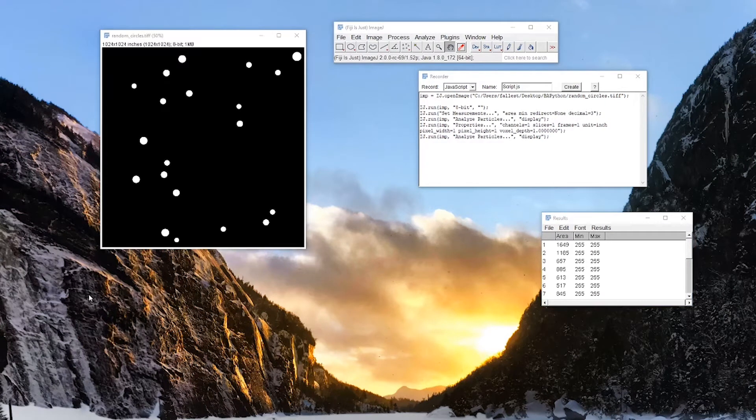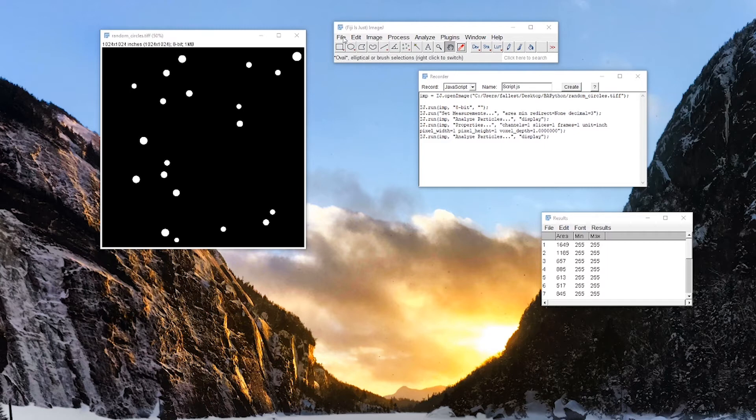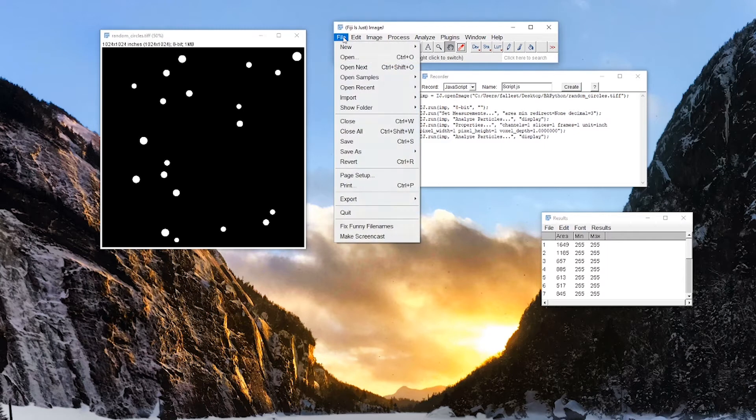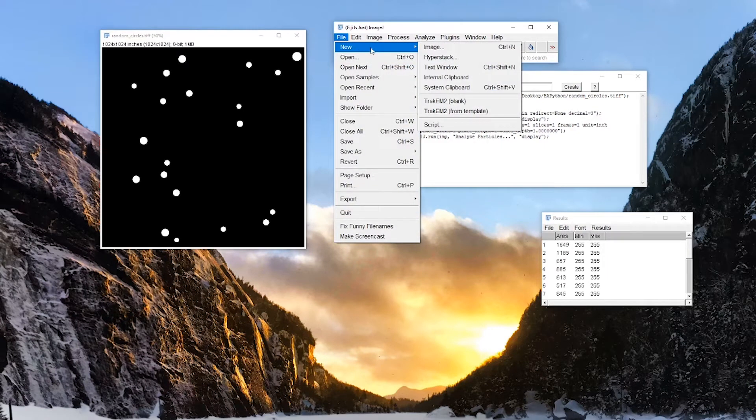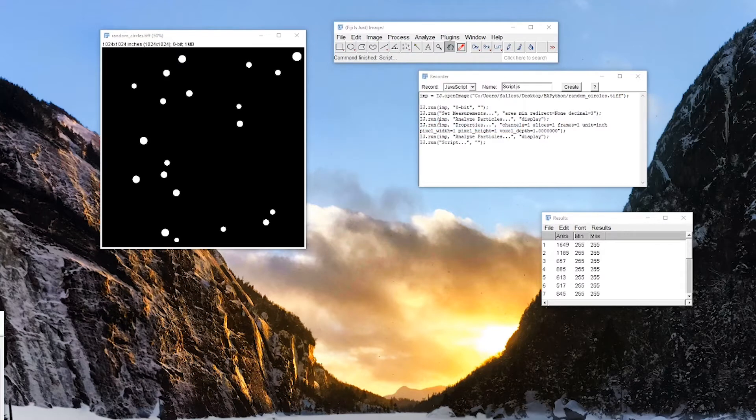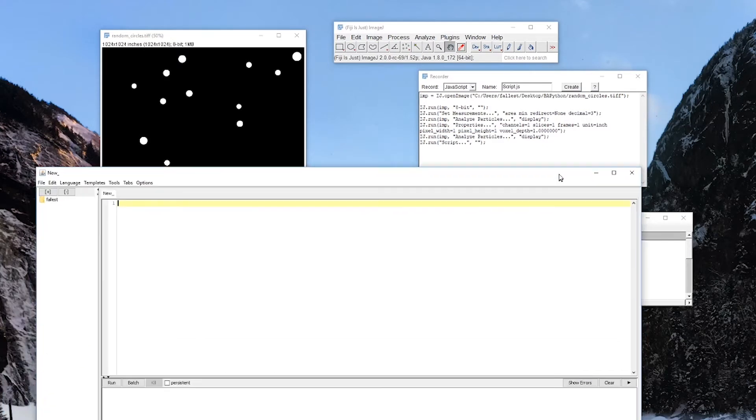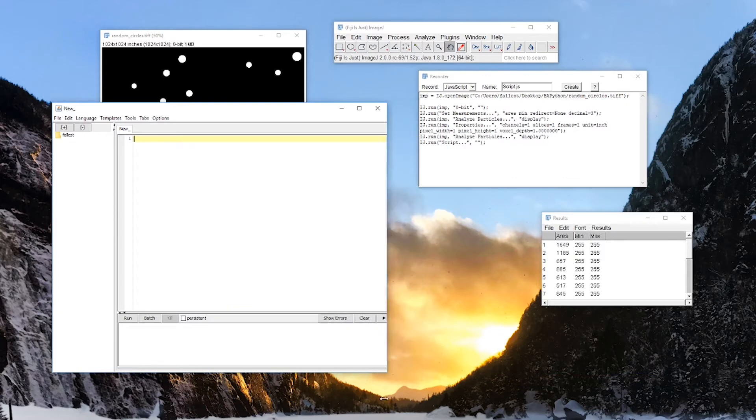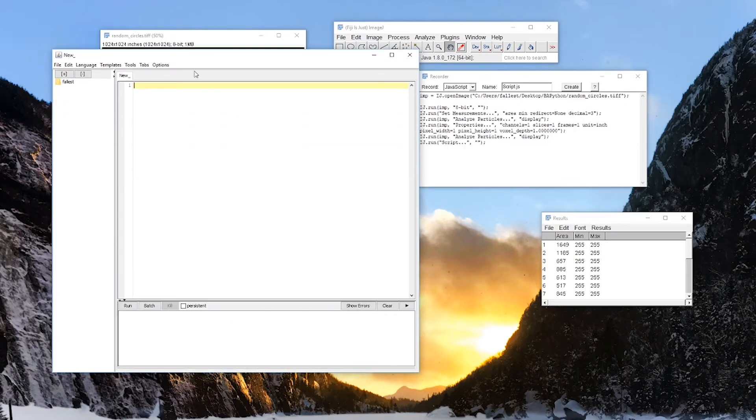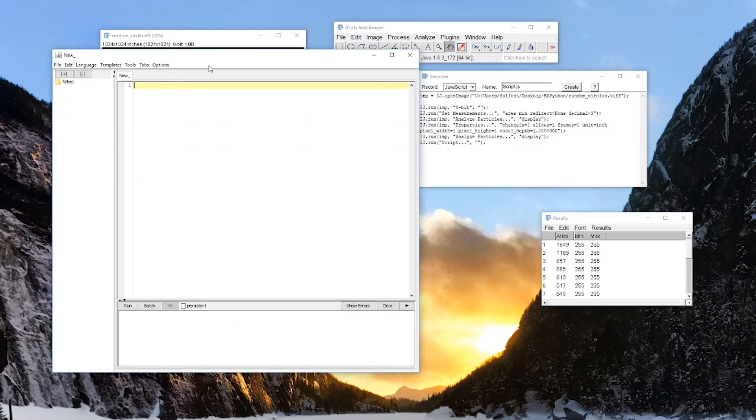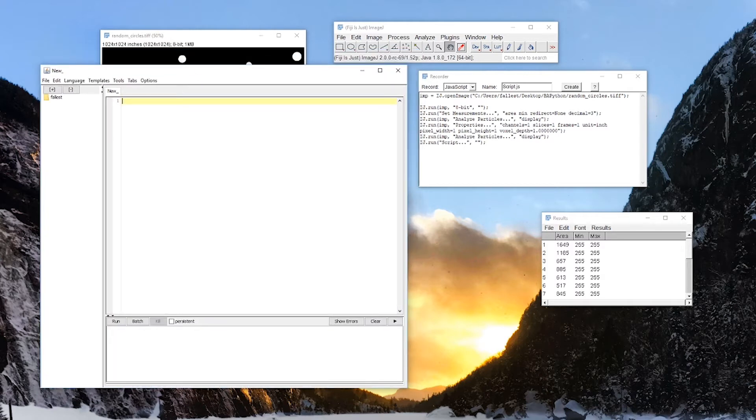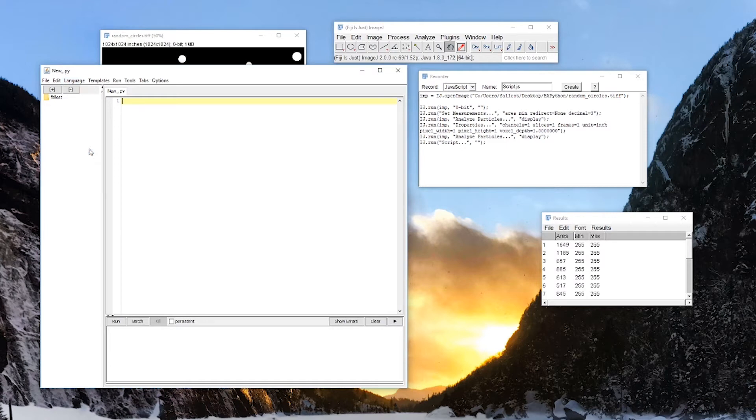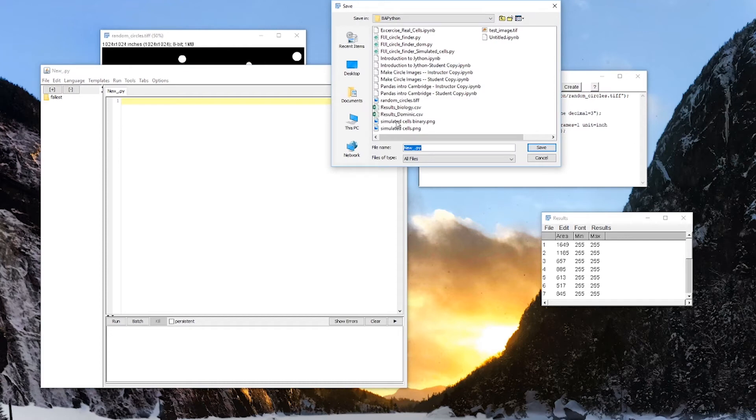So you can write a Python script for Fiji in any text editor, Python editor. But within Fiji, there is a script editor. And here it is. Let's resize this a little bit, make our life easier. So let's take a look at what we need. Well, to start off with, first thing I'm going to do is go up to here, language, and we're going to call this Python, because that's what we're programming in. Then we can save this.